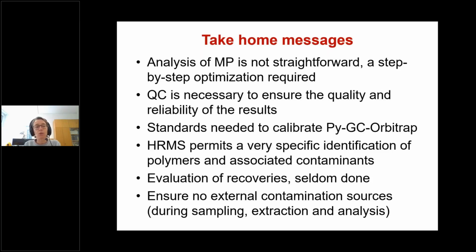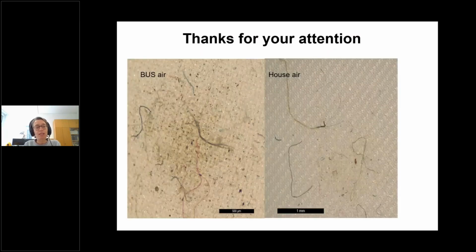And I would like to thank you for your attention, only to show this is a bus air picture and this is a house air. So in here again, it is the ability to analyze all what is present in these samples.